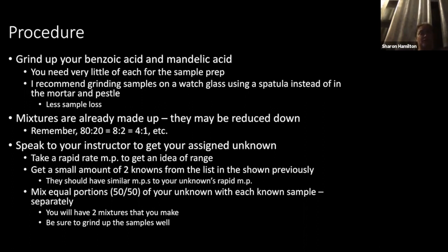Again, your mixtures are already going to be mixed up, and I have that reminder of how HAREL could label it 80-20, talking about percentages. That could also be an 8-2 ratio, or even reduced down to a 4-1 ratio. Keep an open mind for interpreting this information. It all is the same information. It's just perhaps written in a way that you didn't anticipate at first. Don't let this fluster you.